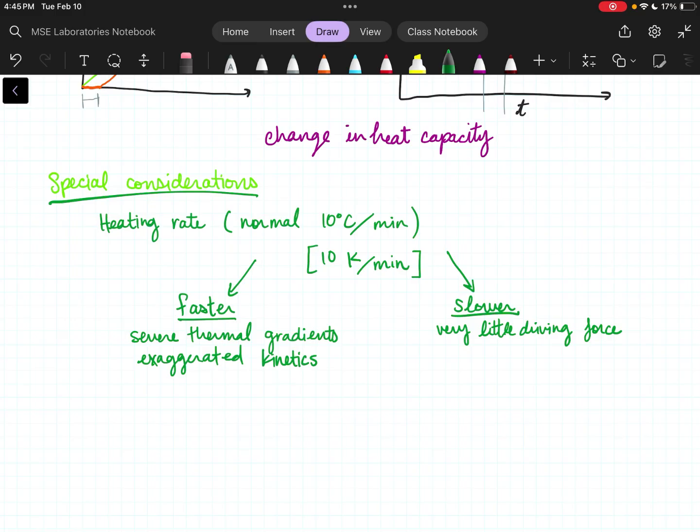But it's going to take a very, very long time for that to happen. And the energy being absorbed by the system is happening in tiny little packets of heat at a time. There isn't a lot of heat for the ice to absorb. And so we're going to get decreased sensitivity, because the ice is melting so slowly that unless we have a really sensitive detector, it's not going to notice that the ice is actually getting warmer. Gotcha.